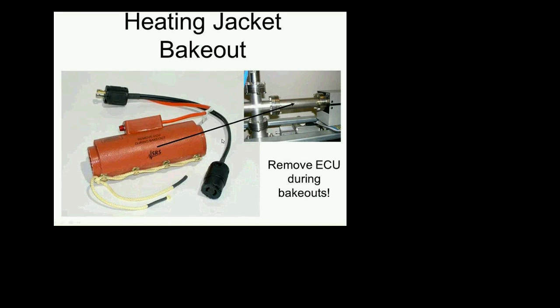The other thing that I'm going to recommend is, as you connect an RGA to a vacuum system, I highly recommend that when you buy the residual gas analyzer, you buy the heating jacket that comes with it. It will be optional, and you might say, I don't want to spend the money on it, but they fit the probe perfectly.